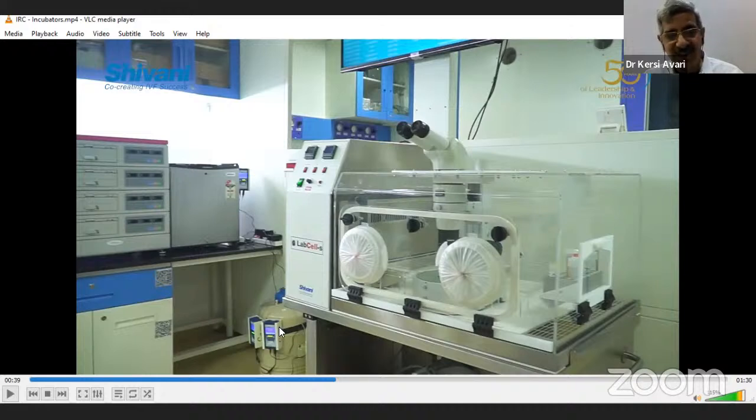Now, over here, you can see these two gadgets, and you can see the cryo can. These are cryo sensors. They will detect the level of liquid nitrogen. It's a sensor which is dipped in. The moment the liquid nitrogen level goes low, the sensor is exposed to the vapors and there is a crash in temperature. Immediately the sensors will give an alarm, which will be detected by you on your handset. So this shows that the tank pressure or the tank levels are going down.